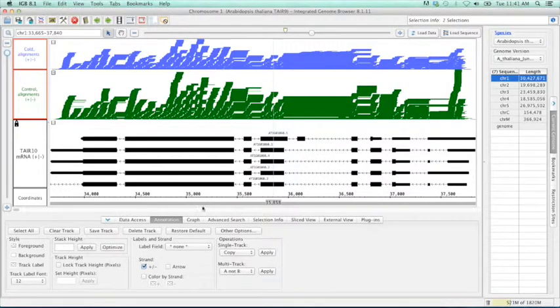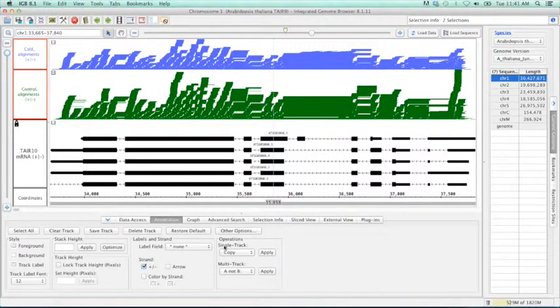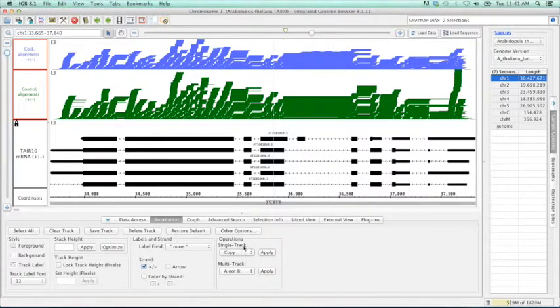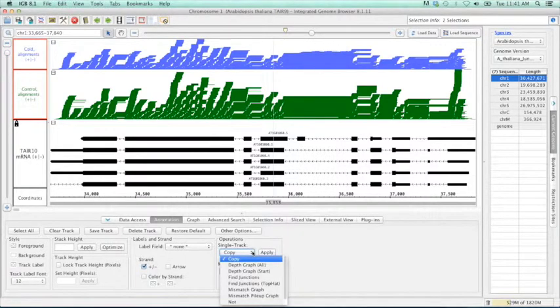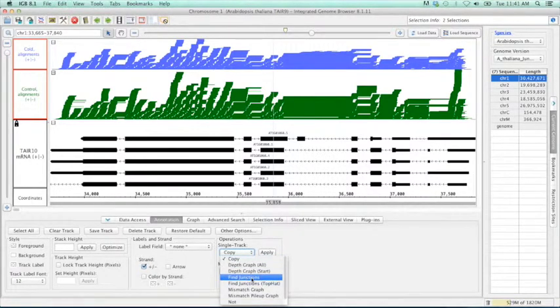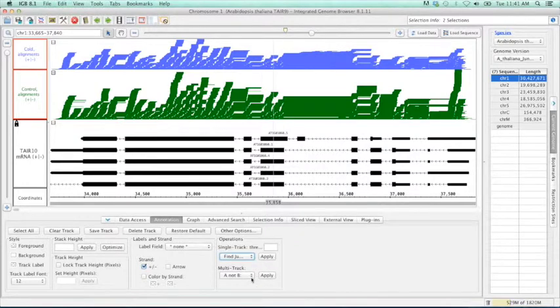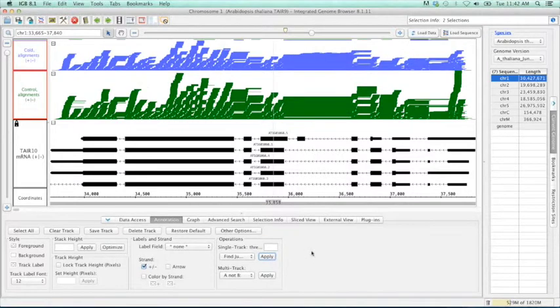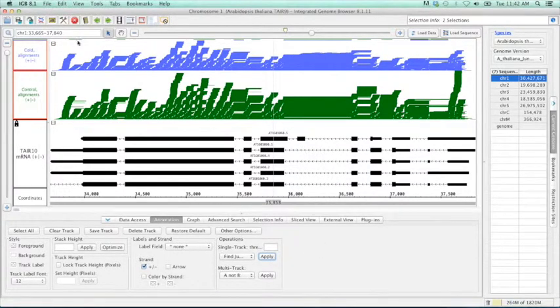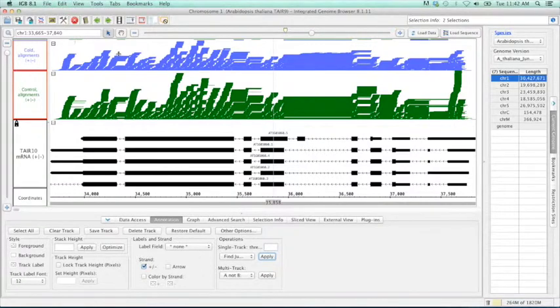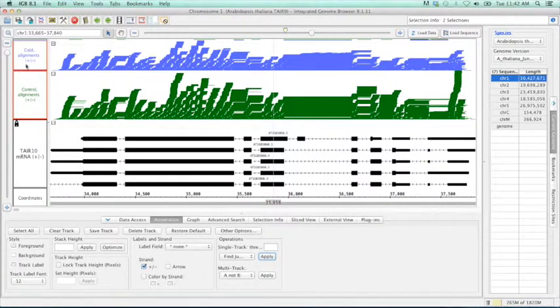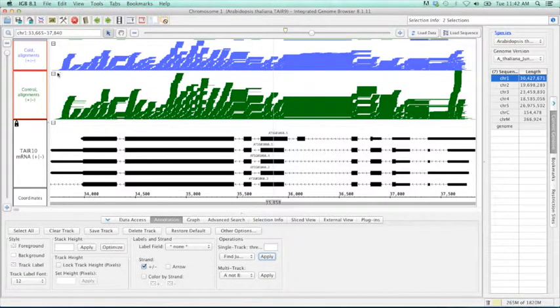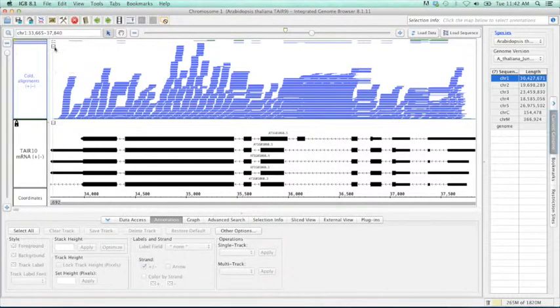Let's select both of these tracks. Let's go down to the annotations tab again. Under the operations, we're going to go to the single track dropdown. And we're going to select find junctions. And then hit apply. And as you can tell, again, we have two somewhat squished little graphs up here. So we want to expand those. The easiest way to do that is we're going to click the minus sign for each of these. And so this is going to simplify them down.